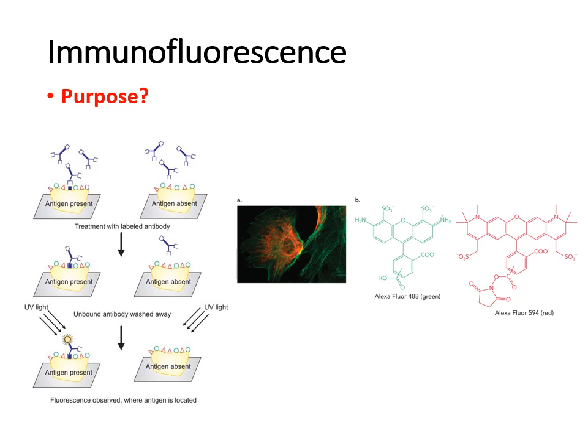It's also antibody based, so it allows you to be highly specific when you are looking for target proteins. After you have prepared and washed your cells, you can visualize the protein you're looking to study through fluorescent microscopy.